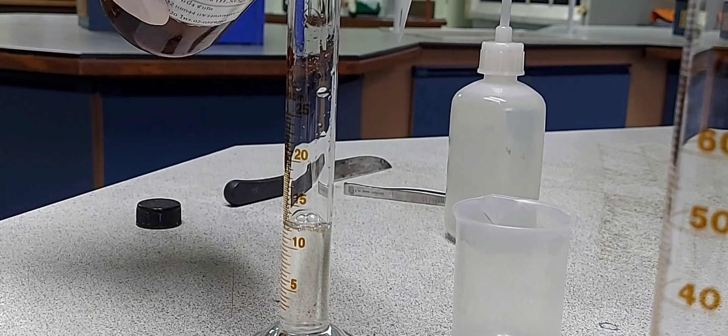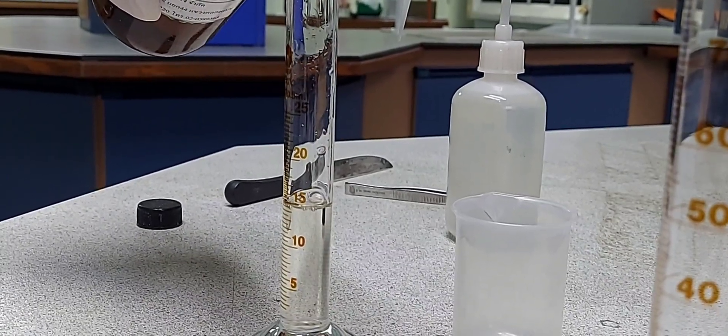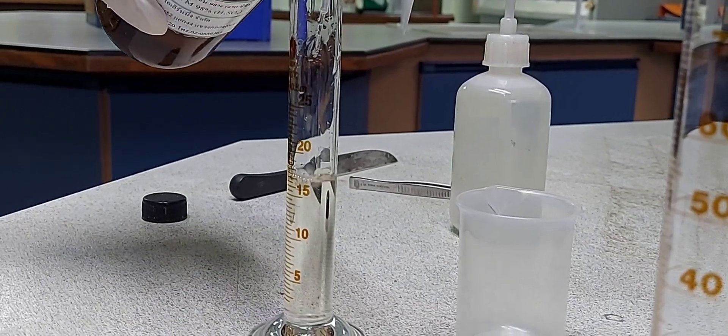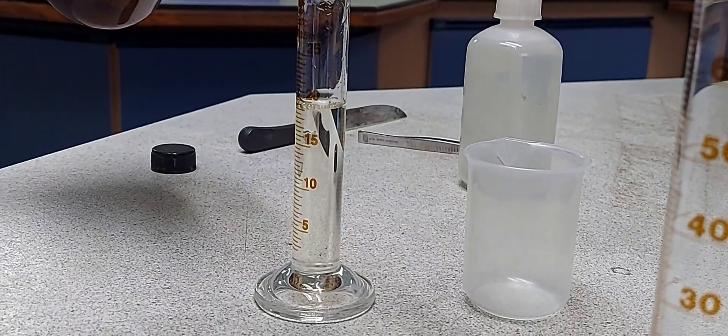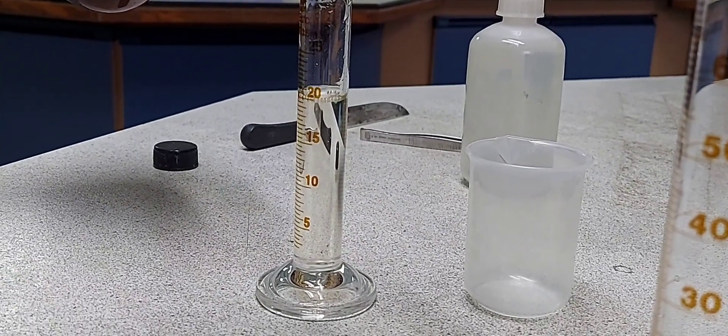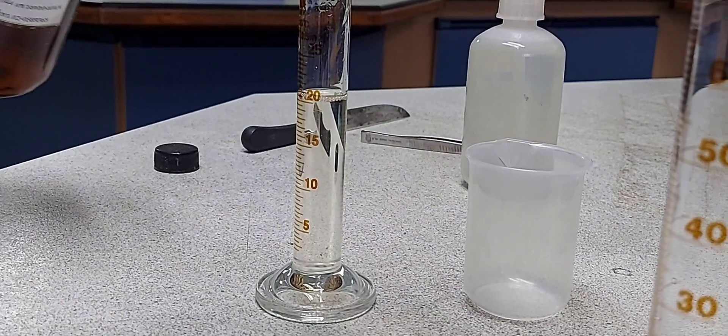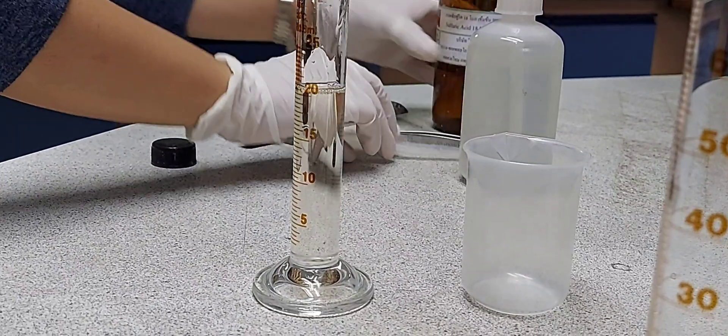So here, 18 molar concentrated sulfuric acid, I am taking 20.8 ml of that acid and the remaining 230 ml water because I am making a concentration of 1.5 molar in a 250 ml graduated flask.